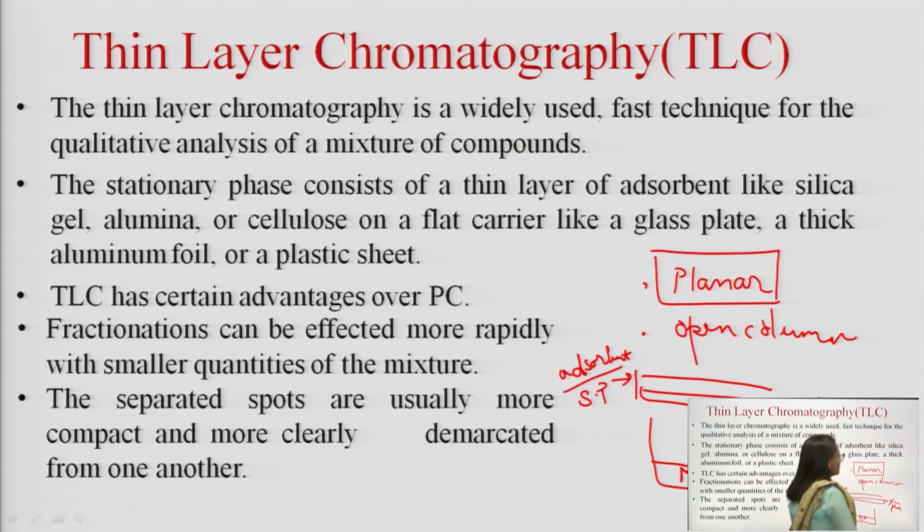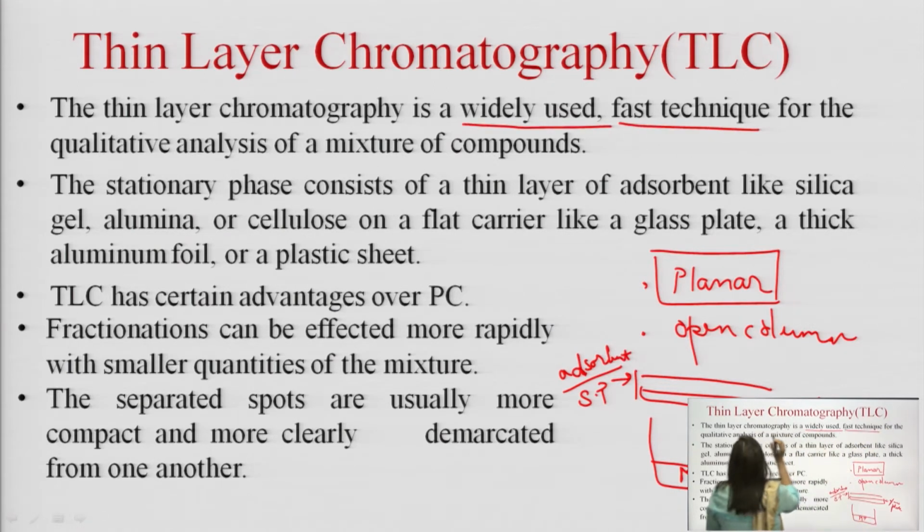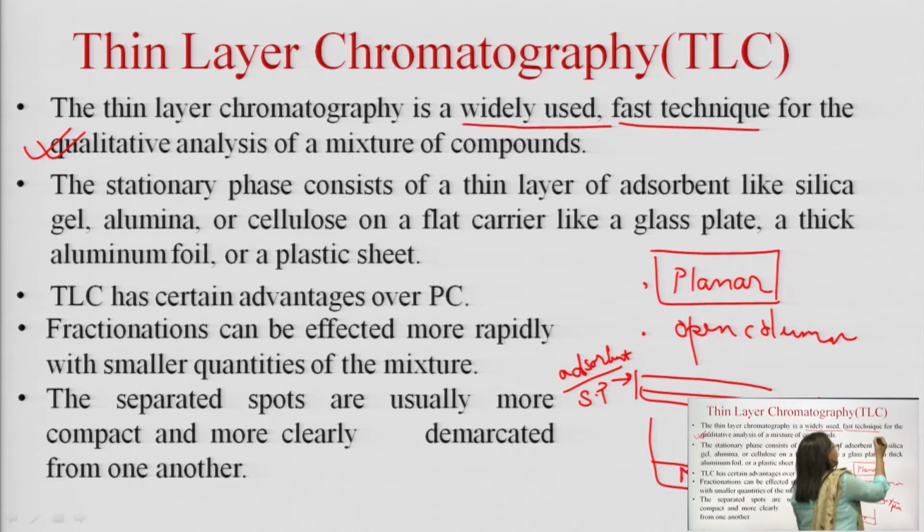Herein, let us discuss that this is one of the most widely used techniques. It is fast in nature and can be utilized for qualitative analysis of mixtures. Let us have a light on this.